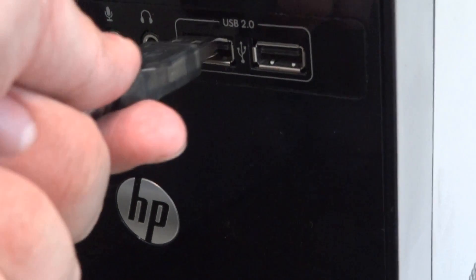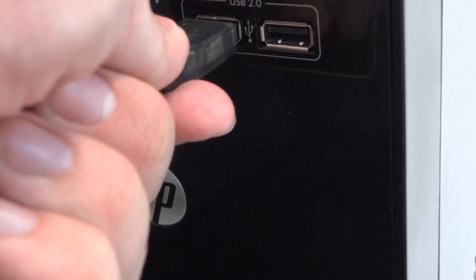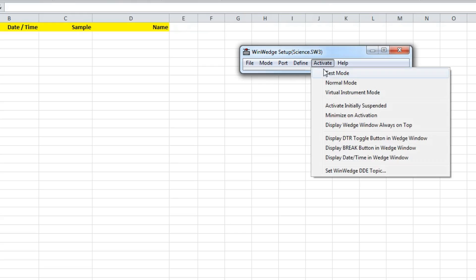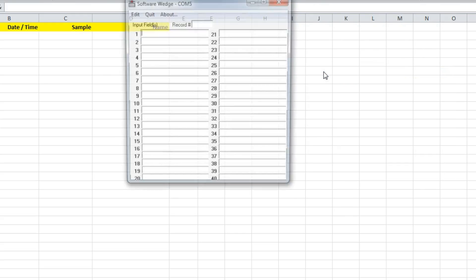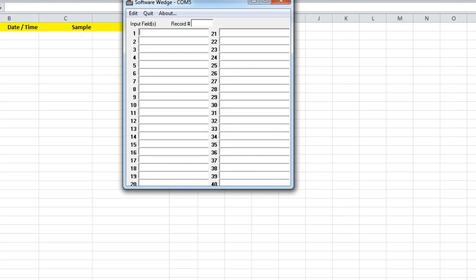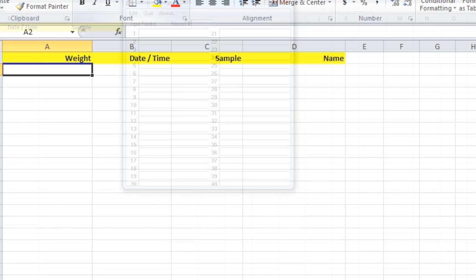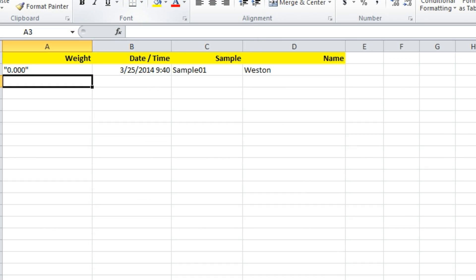After the scale or balance has been connected, you will need software to transfer the weighing data to a Windows-based application.